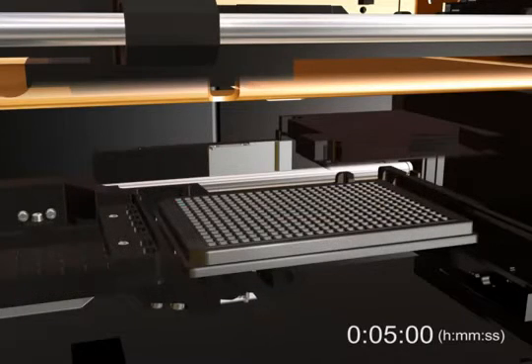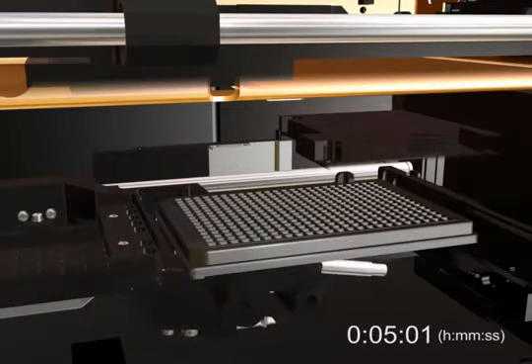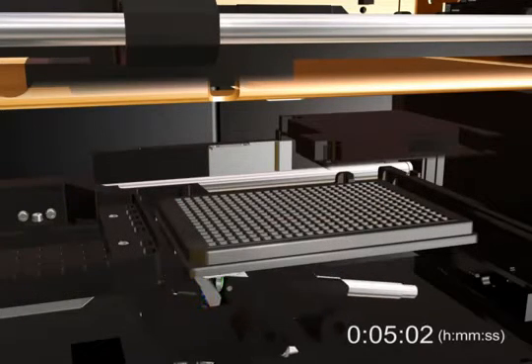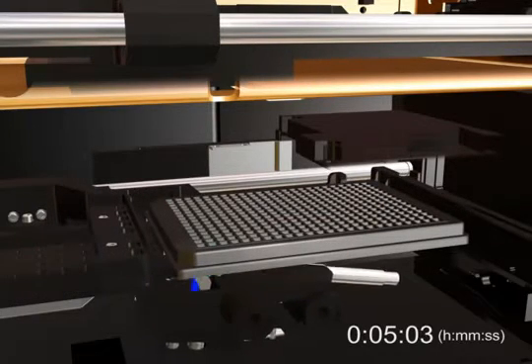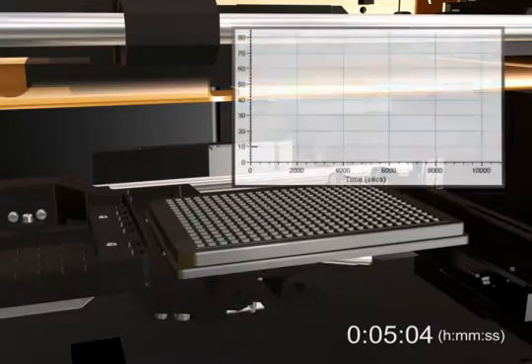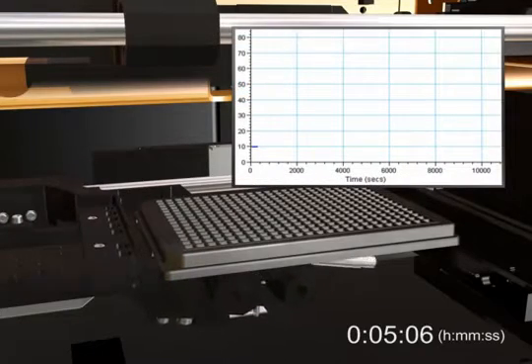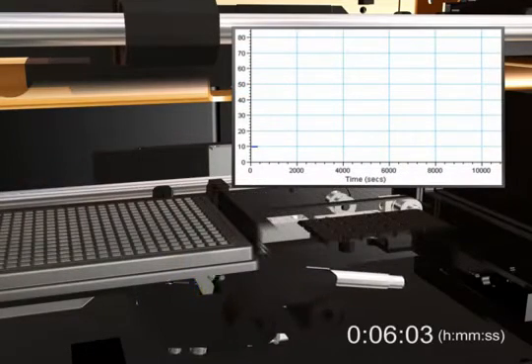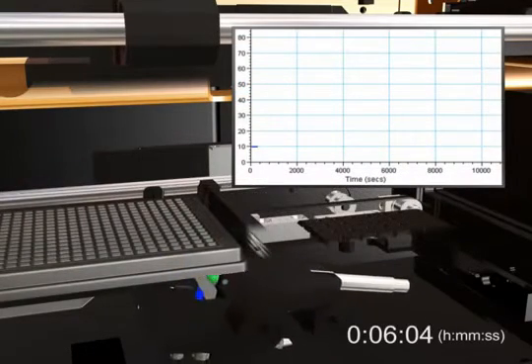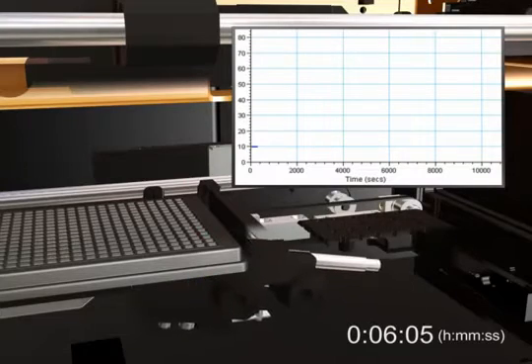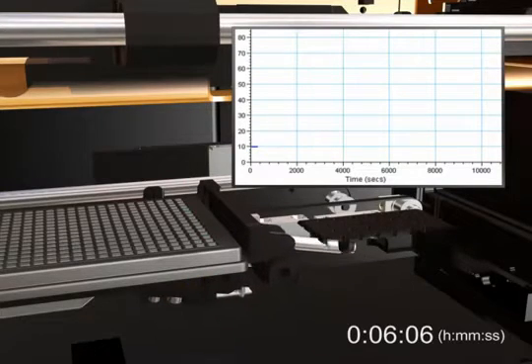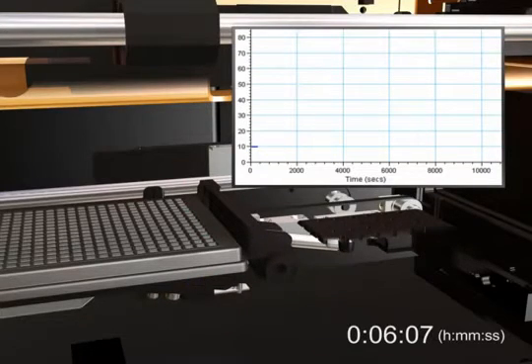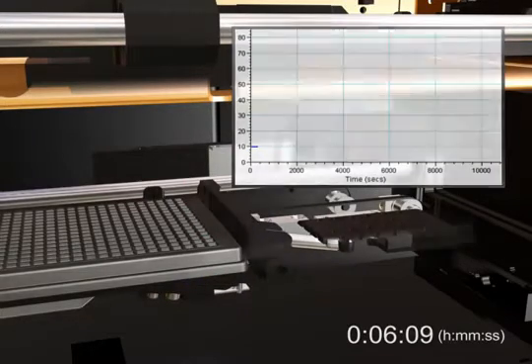At 5 minutes, the second kinetic read is initiated. You can follow the progress of your assay in real-time by viewing well graphs in the Softmax Pro software. Here we see a graph of the initial data points collected during the first read.